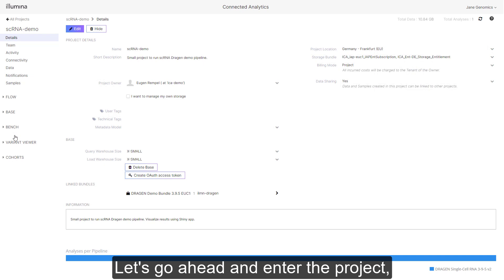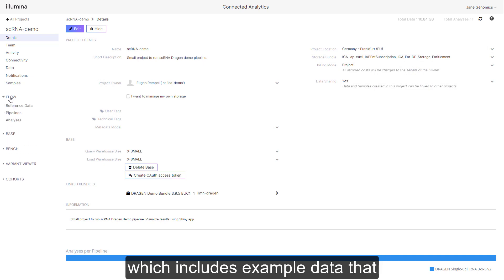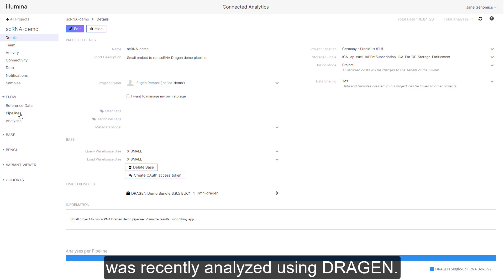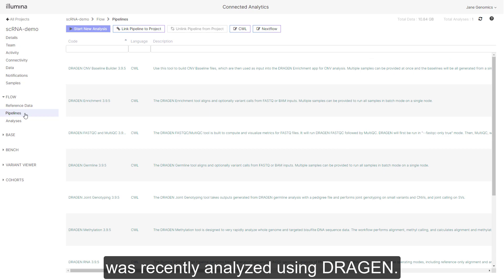Let's go ahead and enter the project which includes example data that was recently analyzed using DRAGEN.